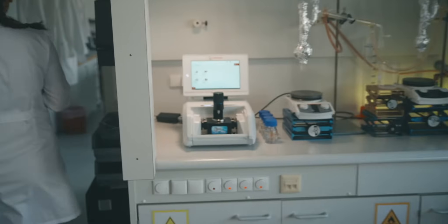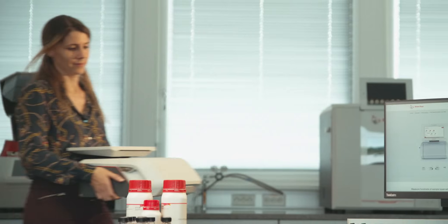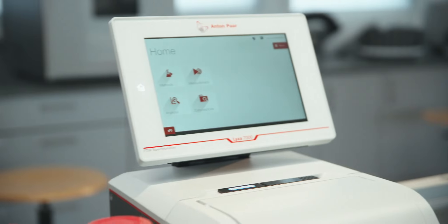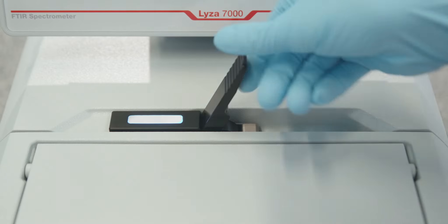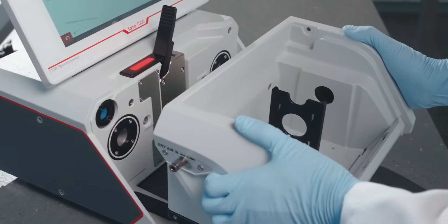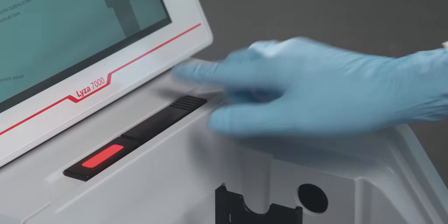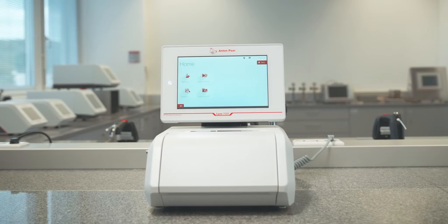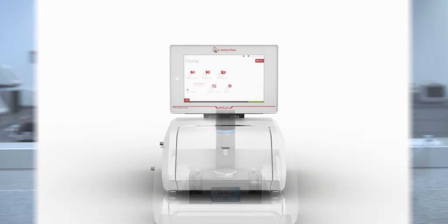Our new standalone benchtop spectrometer makes your workflow simple. Lyza 7000 — one instrument, a world of samples.